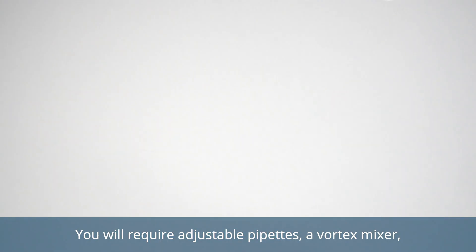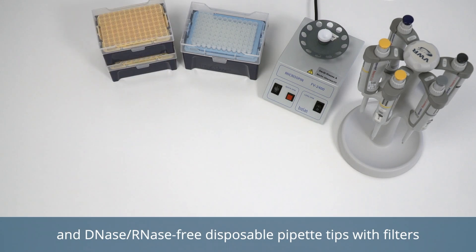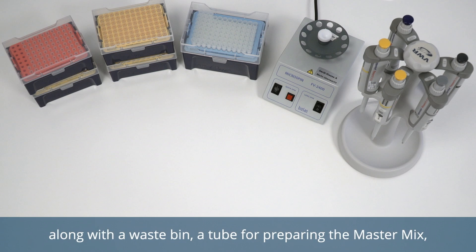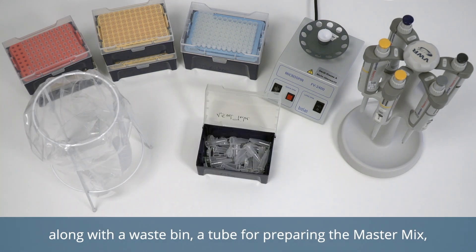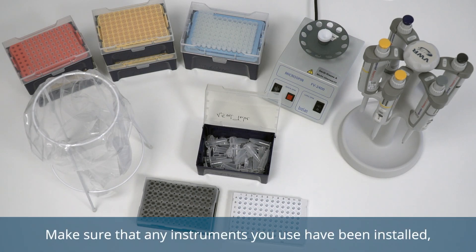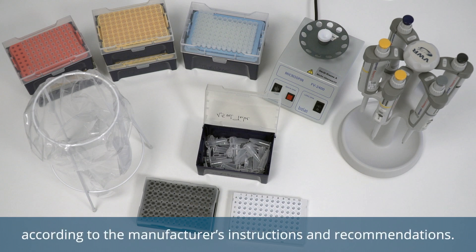You will require adjustable pipettes, a vortex mixer, and DNase/RNase-free disposable pipette tips with filters, along with a waste bin, a tube for preparing the master mix, and a PCR plate. Make sure that any instruments you use have been installed, calibrated, checked, and maintained according to the manufacturer's instructions and recommendations.